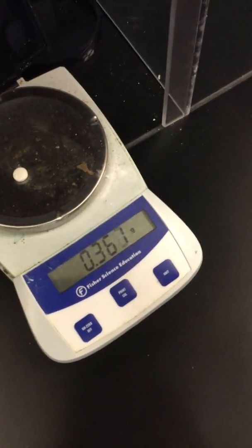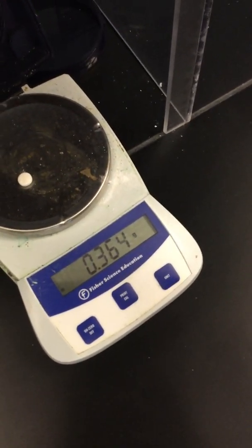Station 11, we've got some aspirin. I'm going to throw this on the balance as well. When we put the aspirin on the balance, we get a mass of 0.364 grams. 0.364 grams for the aspirin.